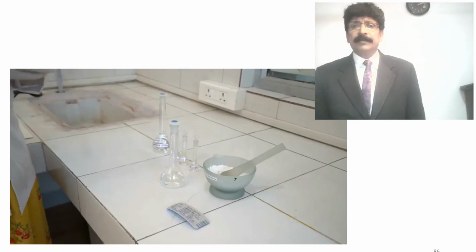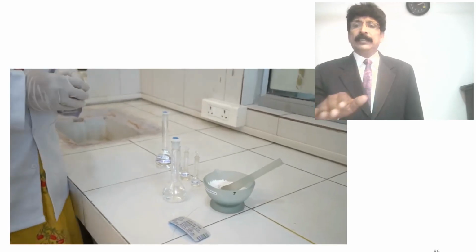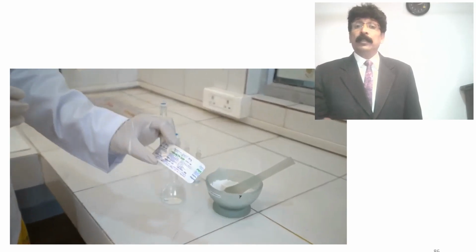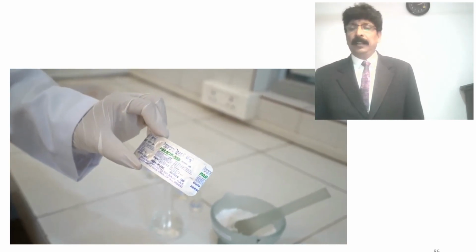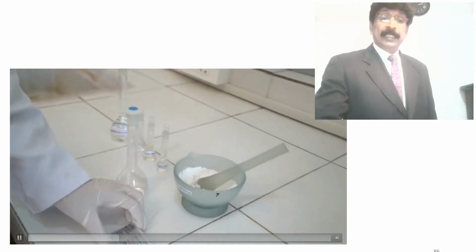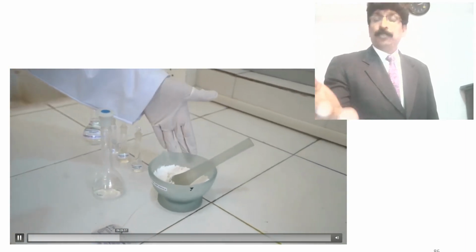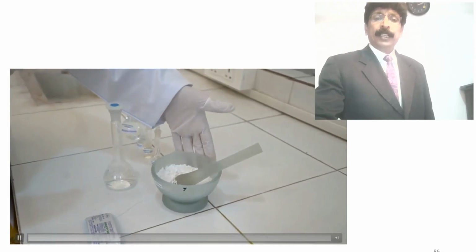When you come to 7th semester, you will be studying in analysis how you are going to prepare the dilution factors and find out the concentration by UV spectrophotometer, analyzing the assay for a tablet. But you can go for this application even for various other techniques also. Crushing 20 tablets and taking the quantity, according to that, she is showing the experiment.